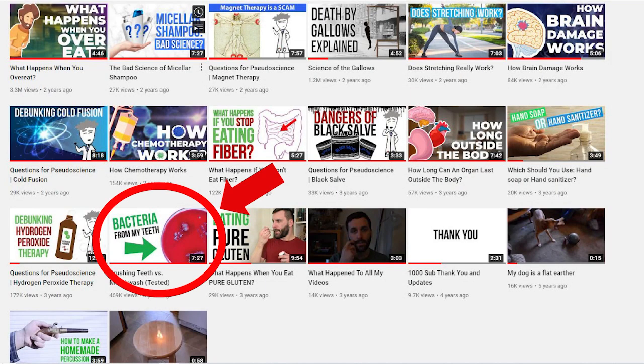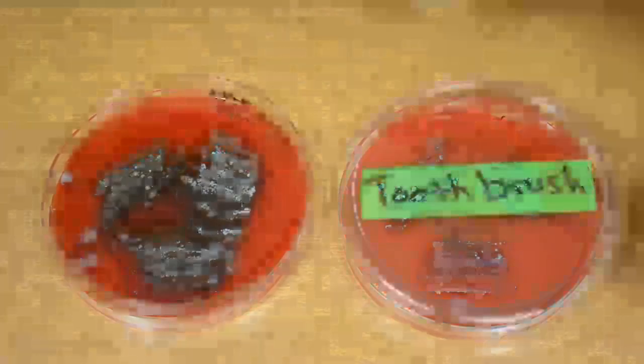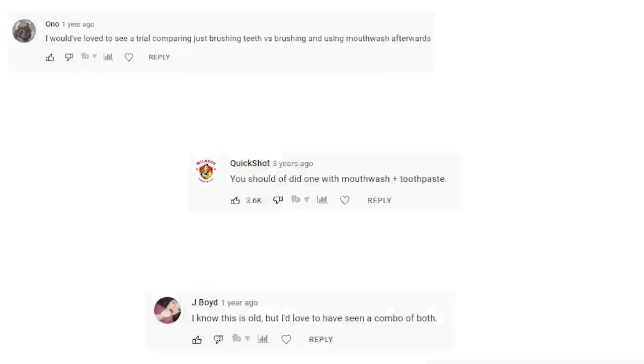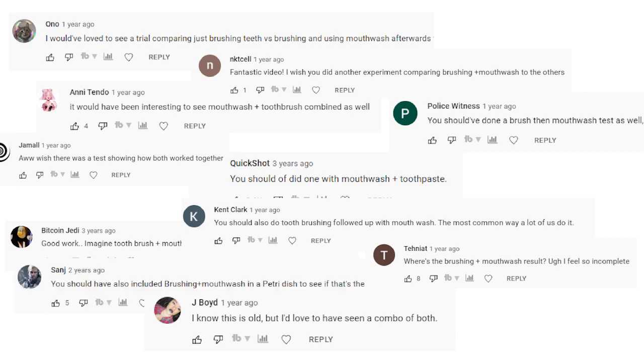A couple of years ago, I made a video on my other channel where I tested whether using a toothbrush or mouthwash was more effective at removing bacteria from my mouth. The results were very much in favor of using a toothbrush. Afterwards, a lot of people commented wanting to see the results of combining a toothbrush and mouthwash to see if it was more effective.